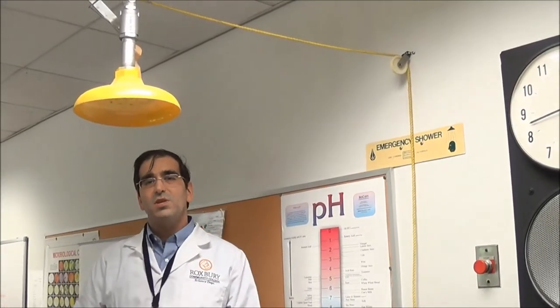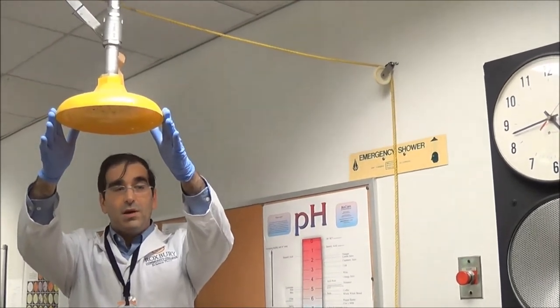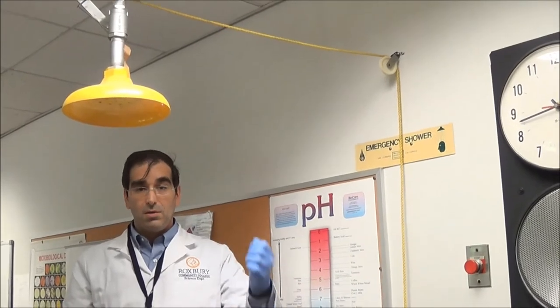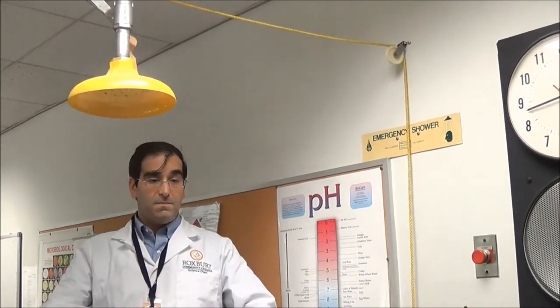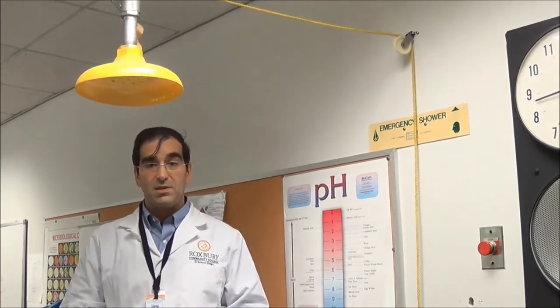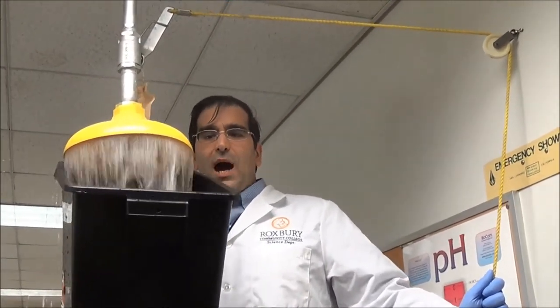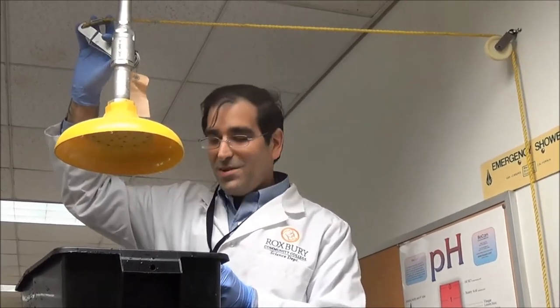Every laboratory space at Roxbury Community College comes equipped with a safety shower. It'll have a conical-shaped end on top to direct the water, and a pulley system — in this case a rope, in some cases a metal pipe — that will activate the water. You want to use the safety shower if you get chemicals or any kind of fire on you. If you get something in your eye, you'd want to use the eyewash station instead — use the proper safety equipment under the right circumstances. When you pull the handle, 20 gallons per minute will come out of the safety shower, so please don't activate it unless you really mean to.